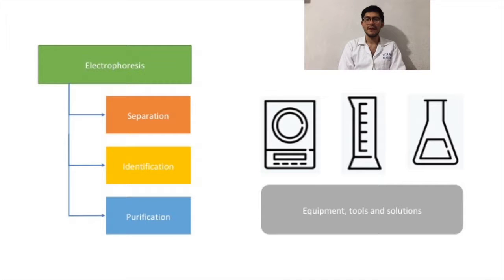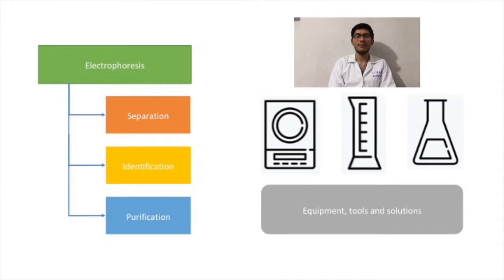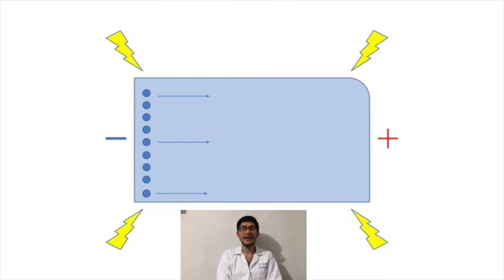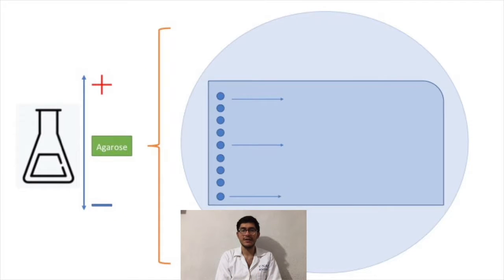The principle of electrophoresis is based on the migration of charged molecules in the presence of an electric field. In this case, the DNA, which naturally possesses a negative charge due to the phosphate groups, migrates from the negative electrode to the positive one of the chamber by applying a specific voltage, taking into account the porosity of the gel, which is directly related to the concentration of the agarose. Said migration and separation of the molecules is based on their size and shape.